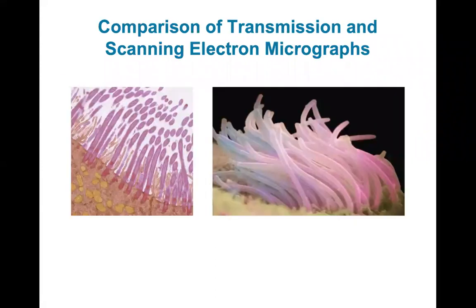Okay. And here we can see the comparison of transmission and scanning electron micrographs. You're looking at the same specimen here. Here you can see this is a transmission electron micrograph, and here's a scanning electron micrograph. So obviously the scanning electron micrograph is going to give you much more detail and more of a 3D view of what you're actually looking at.